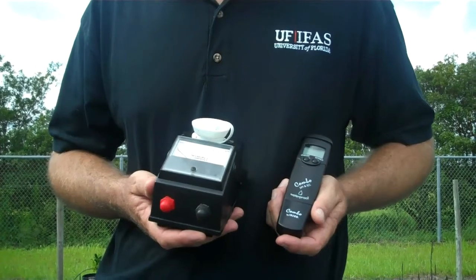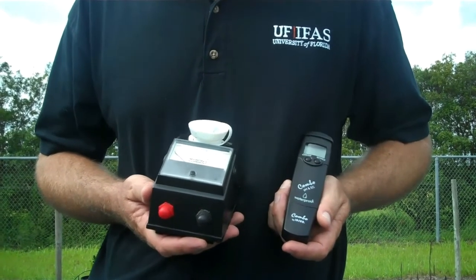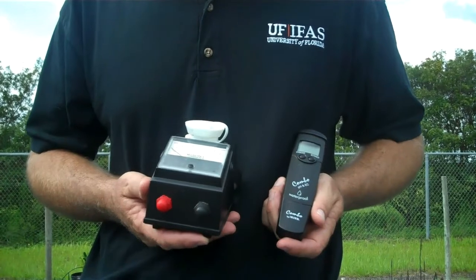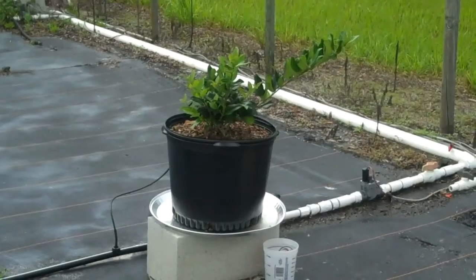The first thing you're going to need to have is a working pH and EC meter. They come in various different sizes and shapes, and they can range from around $150 to over $500. And you want to have it calibrated according to manufacturer's instructions.